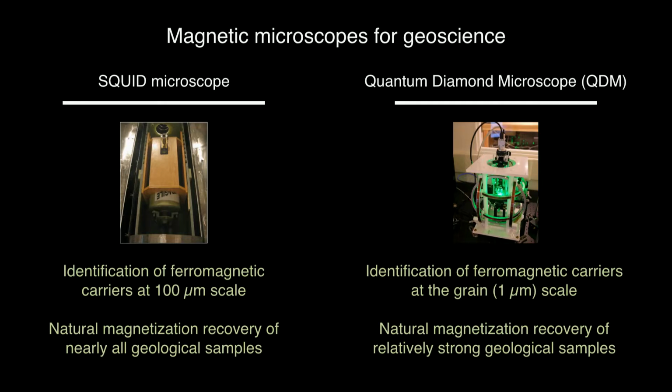Yeah, in theory, as long as you don't go too high, there's nothing in the QDM that can really get damaged. So you can just put an AF coil on it and turn it off while you're imaging. But we just haven't gotten around to trying that.